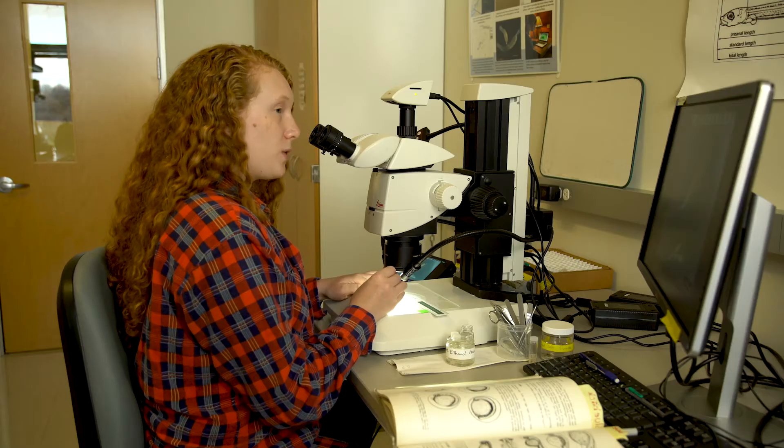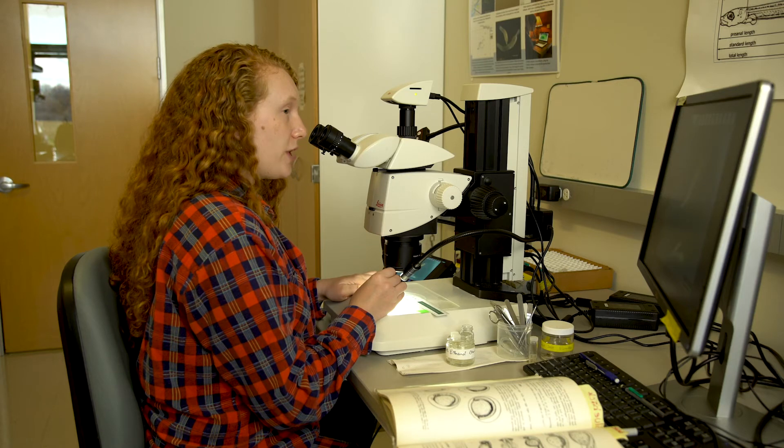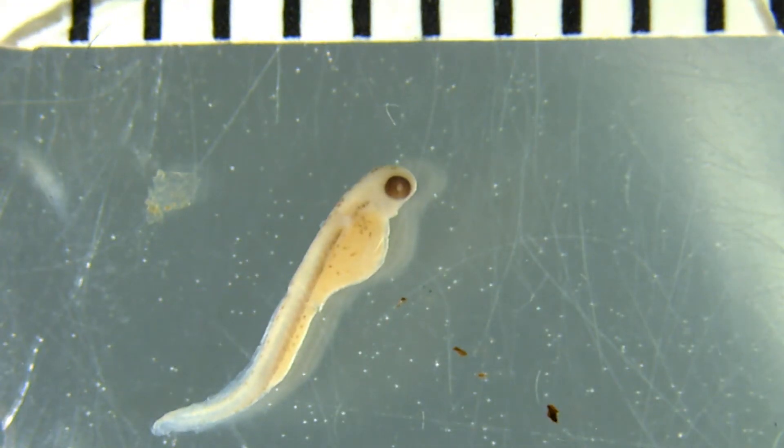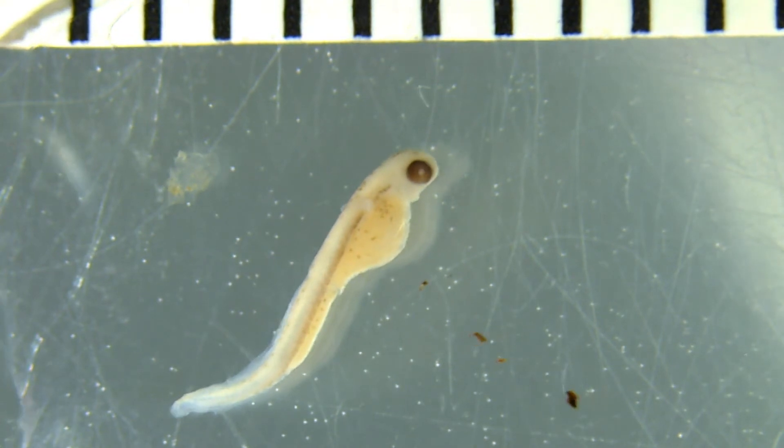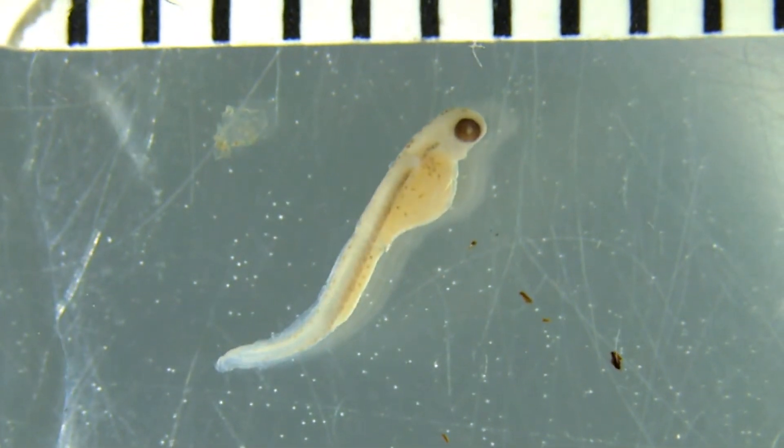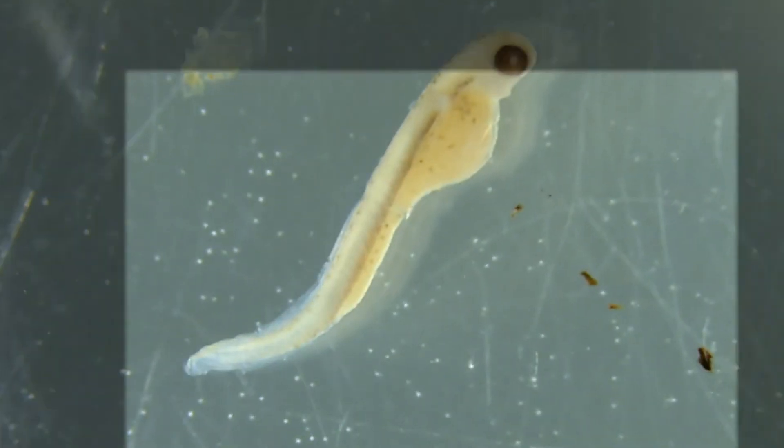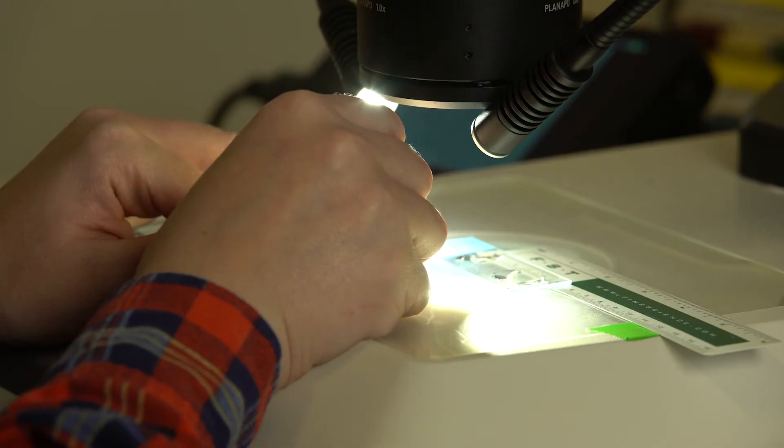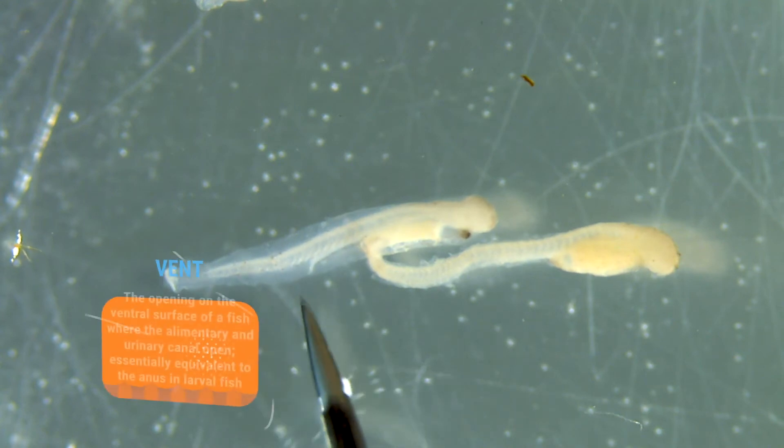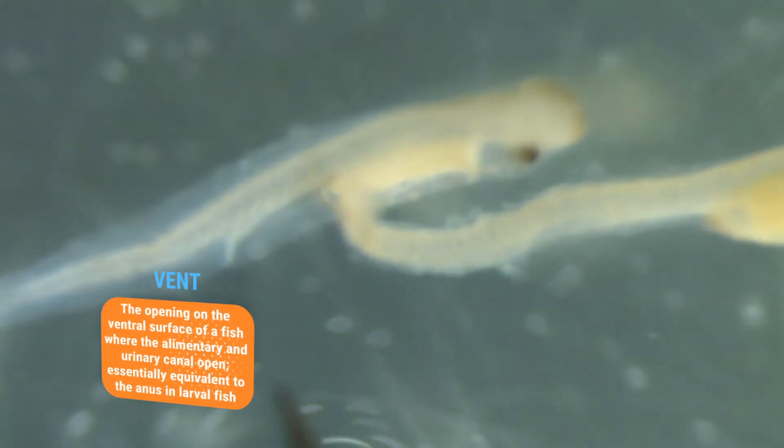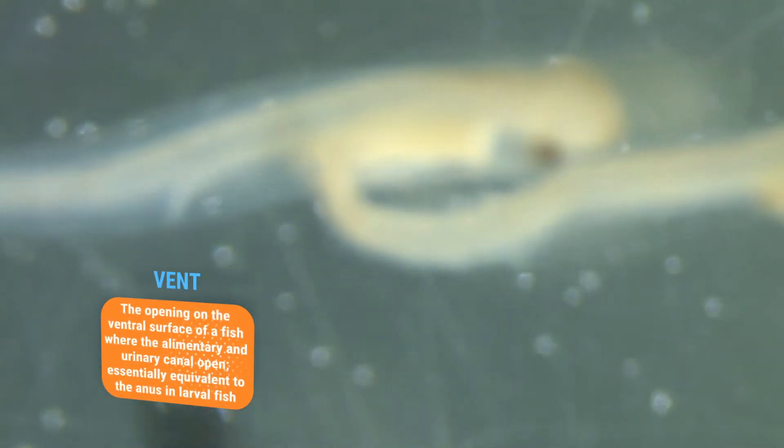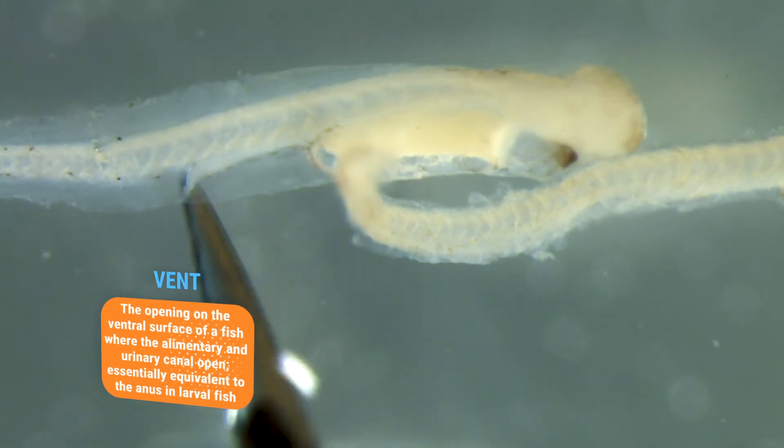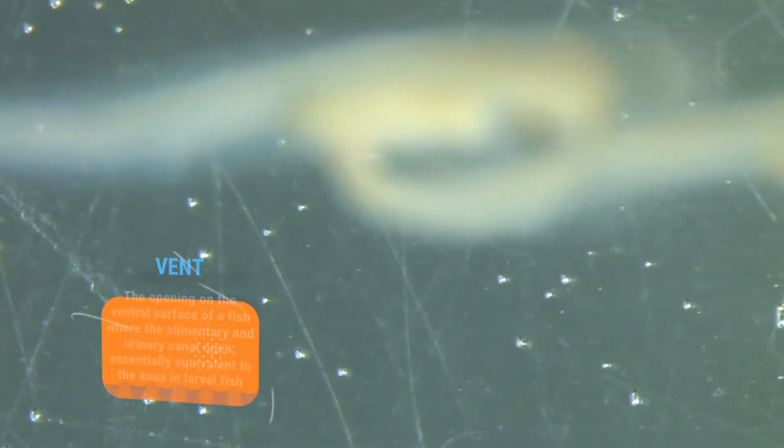So one of the most important is the location of the vent. So your vent is the opening at the end of the digestive and reproductive tract. His vent is going to be at the very end of his yolk sac, right there. This white perch at the top, the end of his vent is right in the center of his body. You can see what would be his intestine slash reproductive tract, that little pale white line going down his yolk sac all the way to the end. So that's what you look for.